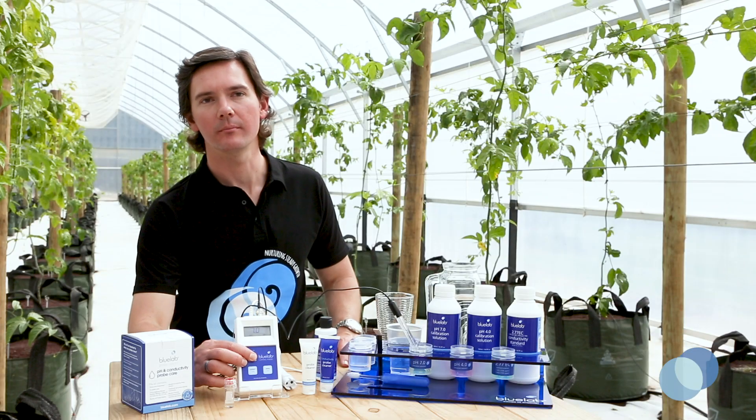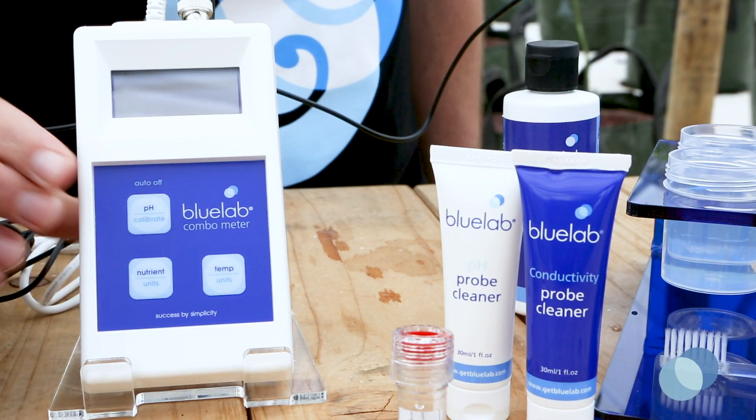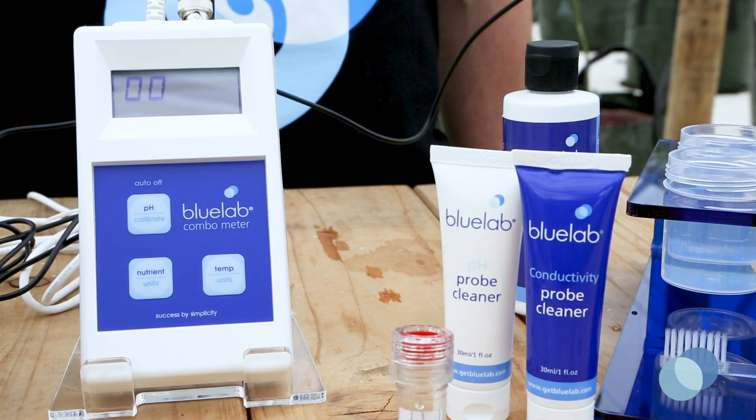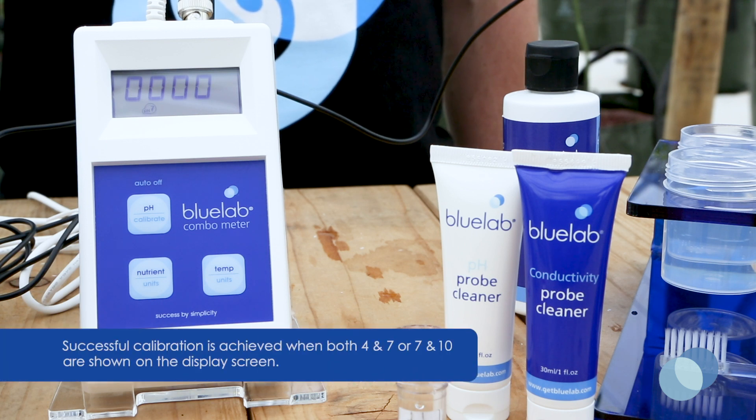Press and hold the calibrate button until CAL displays on the combo meter screen, and then release your finger. You'll see a series of flashing symbols on the screen letting you know the calibration process is taking place. The pH 7 calibration indicator will now appear on the display.